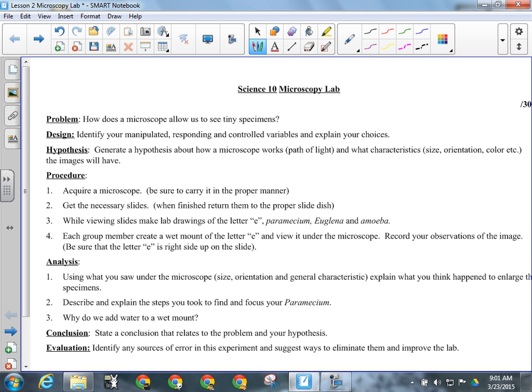Okay, it's too big, and if you look at it on high power, all you'll see are the little ink blots of one single part of it. We want to be able to see the entire letter E, so we can see if it's changed in any way other than being bigger. Other things will remain the same. Probably how you do things would be things to think about. Did you do something the same way every time? What are those things? Stuff like that.